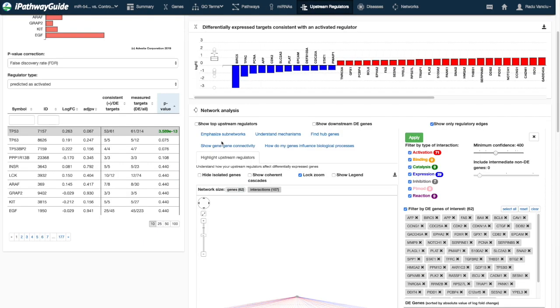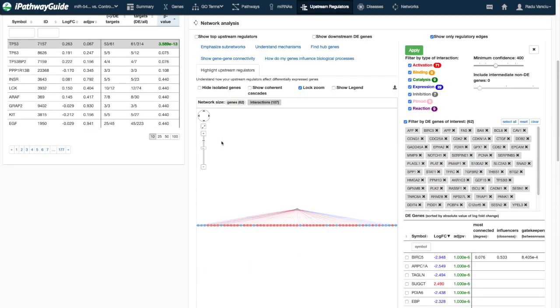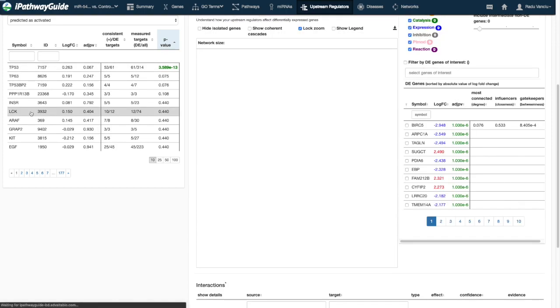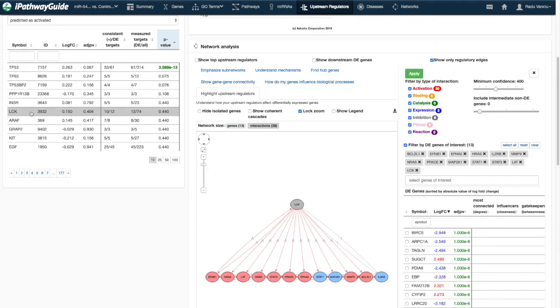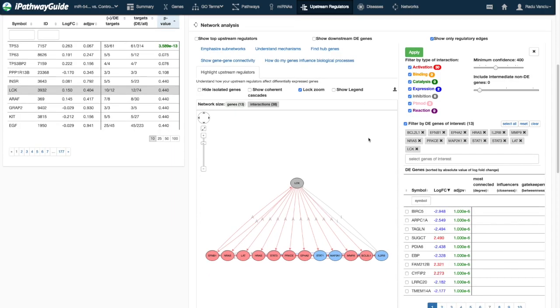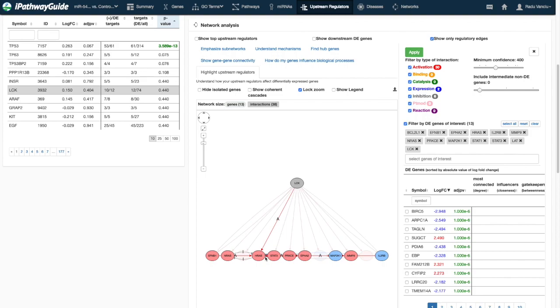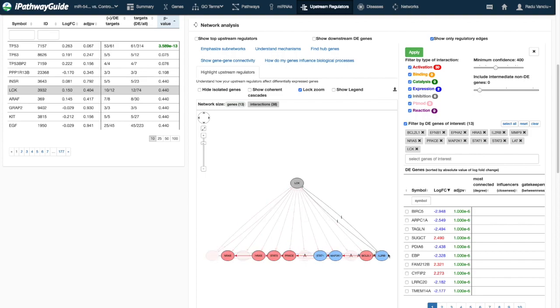In the Network Analysis section, there is a graphical representation of the selected regulator and its interactions with all downstream differentially expressed targets. All differentially expressed targets are shown, whether they are consistent or not with the type of regulation.